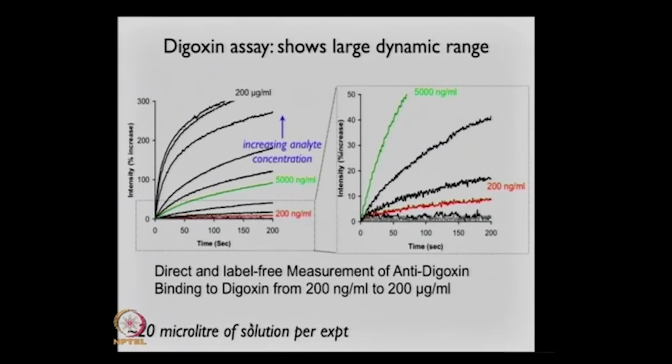I think that's quite good, but probably we can tweak it around to enhance the signal. So this is still, of course, only label free. It also is in that little breadboard setup I showed you earlier, so not optimized in any way. In fact, some of these experiments we had done earlier just on a webcam with a manual capture of the intensity.